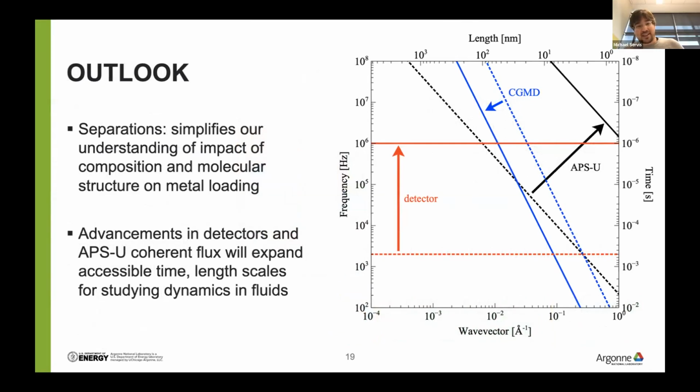So I think that the coarse graining is important. This shows that we just get lots more flux, but that's actually not the whole picture. When we have lots of flux, we end up with lots of potential beam damage. And so we don't necessarily get to take full advantage of the flux that we have. And so I think we want to put ourselves in the best position possible by pushing the boundary, both length scale and time scale, on the simulation front. I think that's really important. Just if there's this nominal overlap, it doesn't necessarily get us the whole way there.